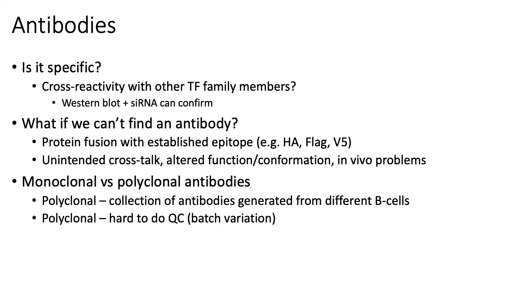Some of the problems with using antibodies in the ChIP-seq protocol is that it turns out to be really hard to get a highly specific antibody, because a lot of transcription factors are part of larger families or share DNA binding domains that are highly similar with other unrelated transcription factors. So you can develop an antibody against your transcription factor, but it can be hard to develop one that doesn't also cross-react or recognize TFs that are not of interest to you.